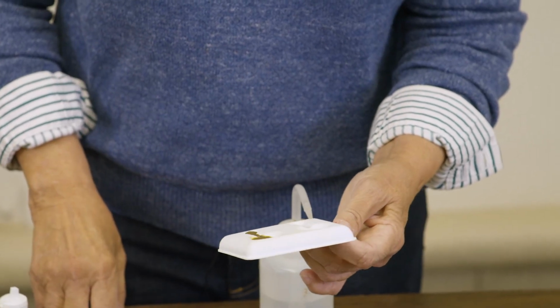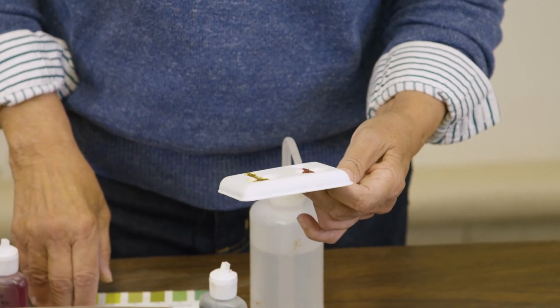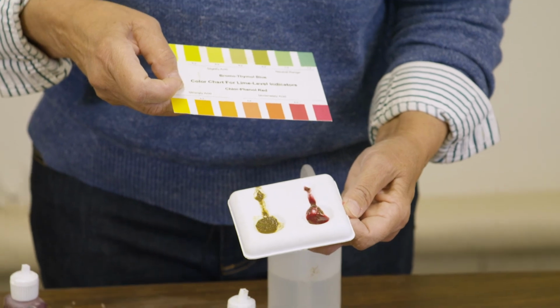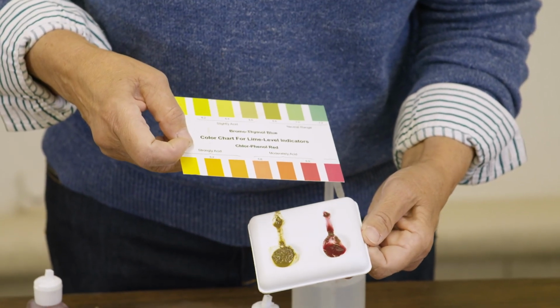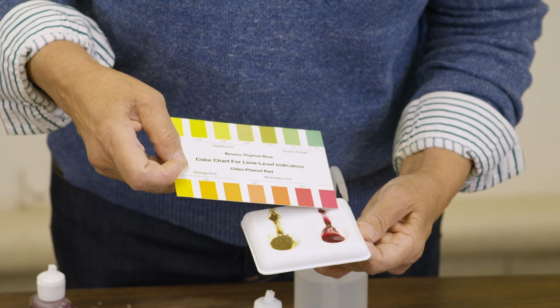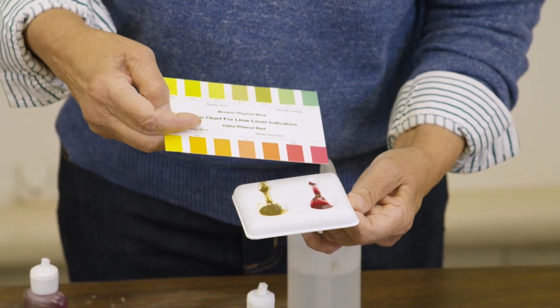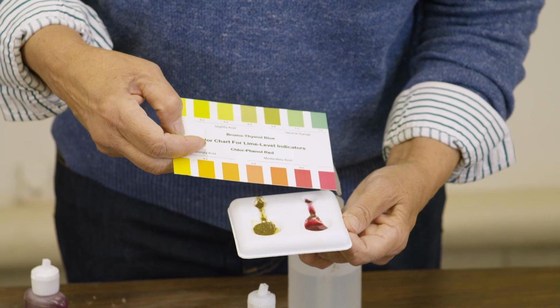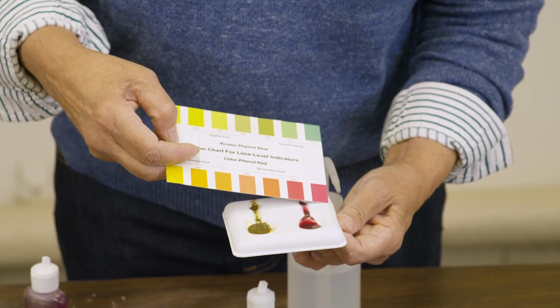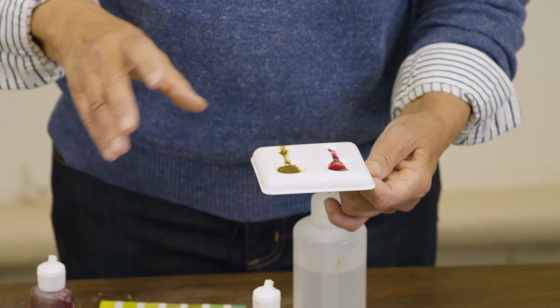Now we're going to allow that bead to go down the channel, back and forth. And we're going to use the color chart at the bottom, which says chlorophenol red, to see what our color is. You can see we're at the 6 to 6.2 range. So in fact, the 6.2, which we saw with bromthymol blue, is correct because we've corroborated that with another solution. So here it's 6.2, pretty close. So I'd say it's about 6 to 6.2 pH, and that would be the final determination for this soil.